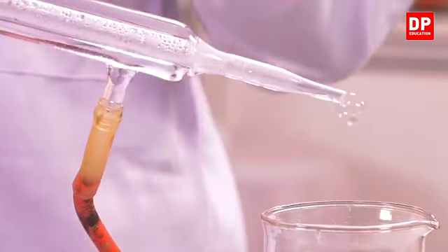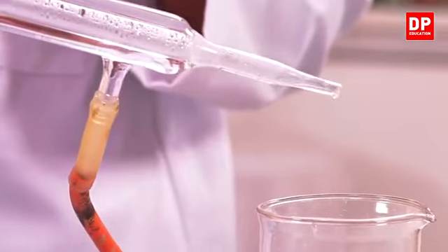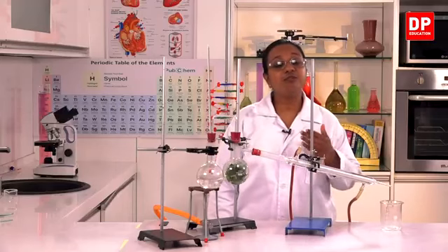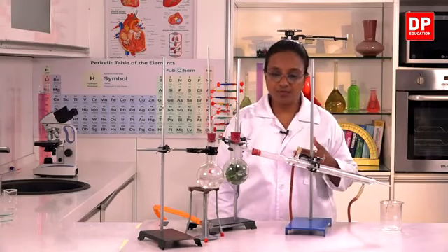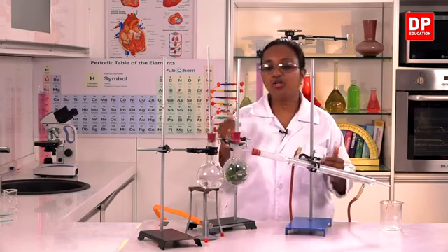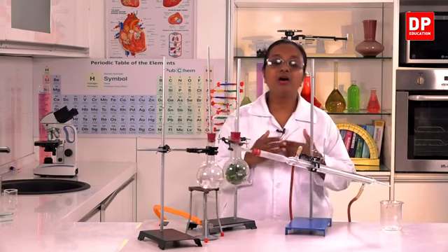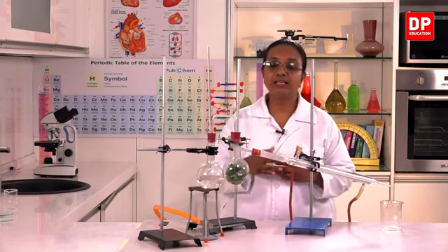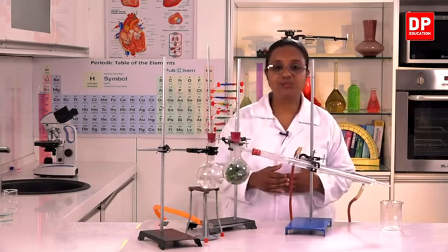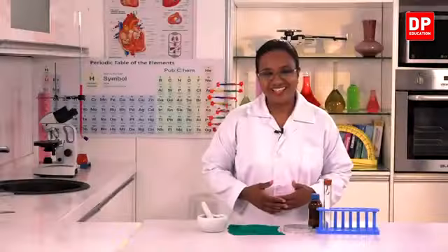If you need to observe the separation of the oil and water layer, we have to carry out this activity for a longer period of time. So here the main aim is for you all to understand how the setup is connected and how the steam distillation process takes place. Okay, students.